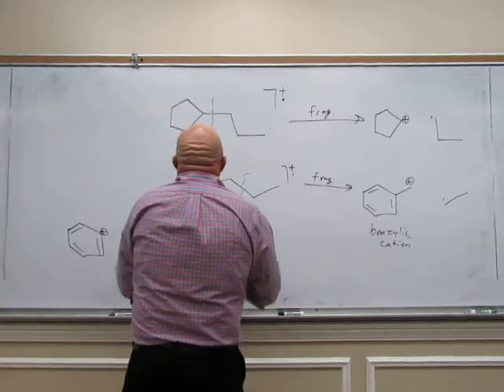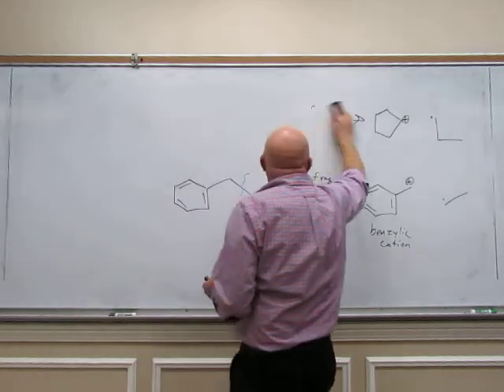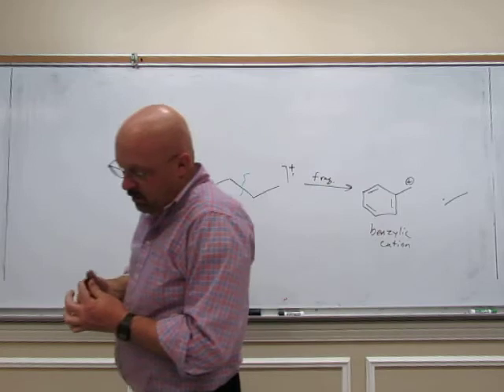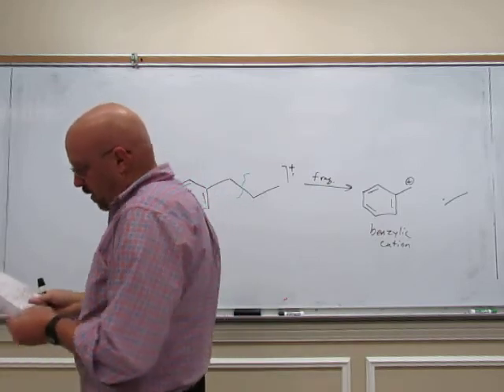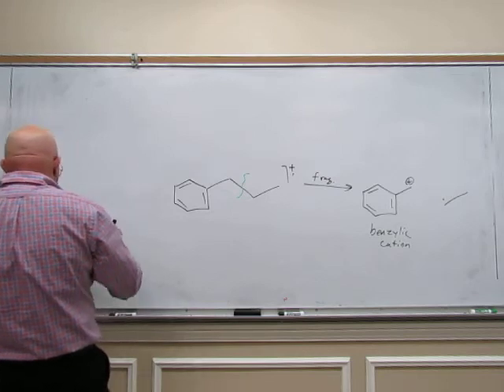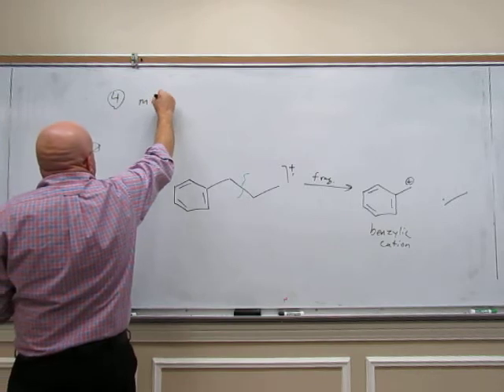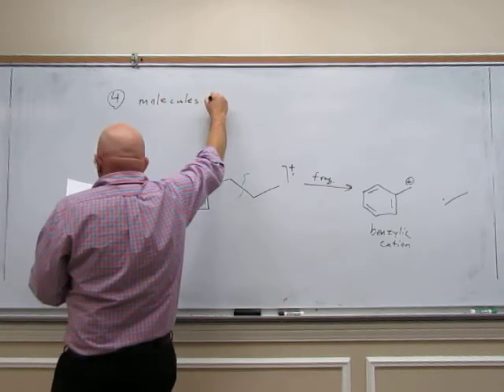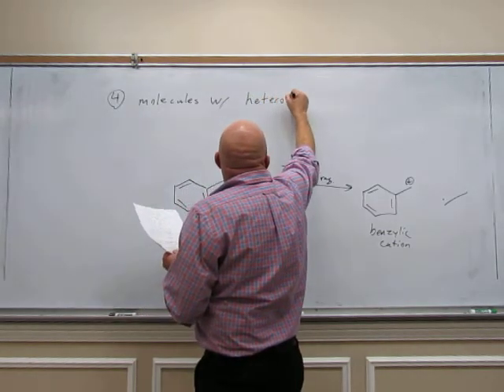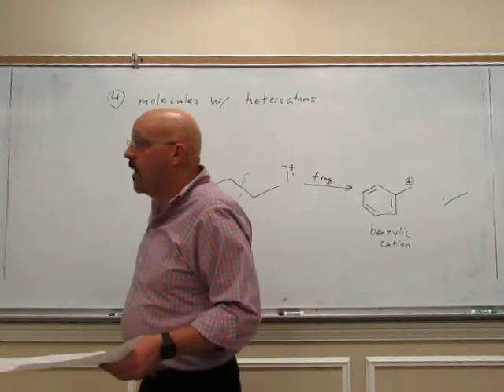Okay, our next rule deals with molecules that contain a heteroatom. What are our heteroatoms?